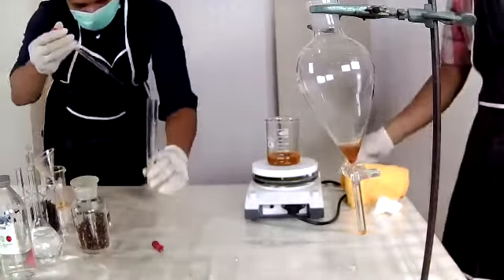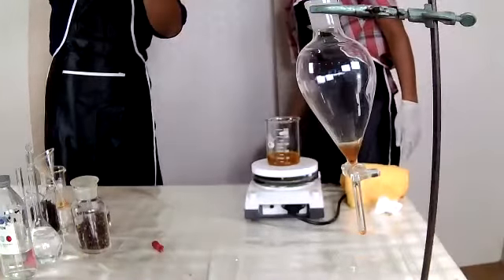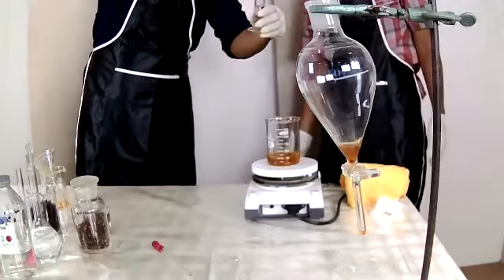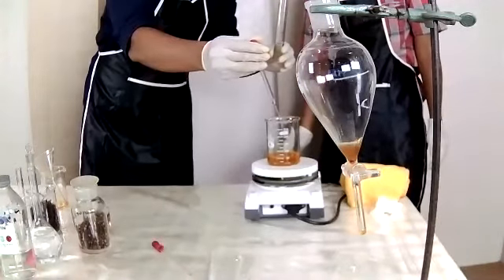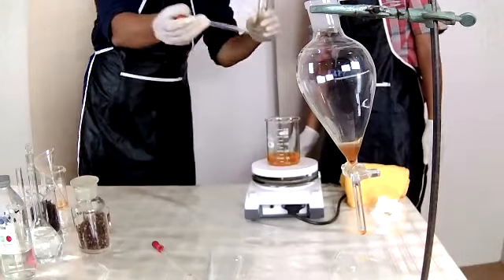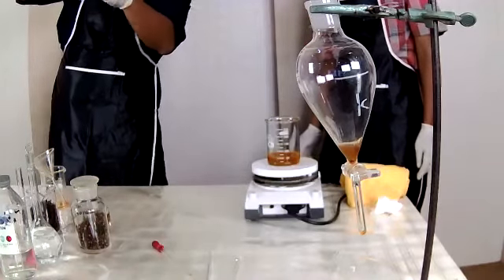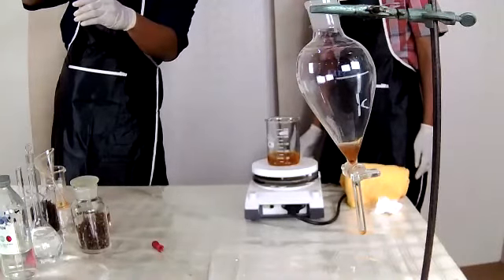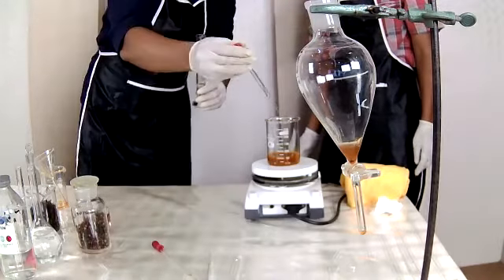We are looking for a pH level of 4. We can add 2 milliliters at a time. And you can see the color changes every time we add more hydrochloric acid. It will result in insoluble eugenol.